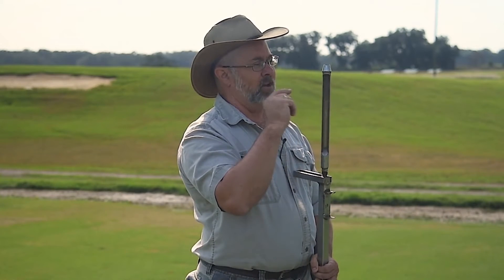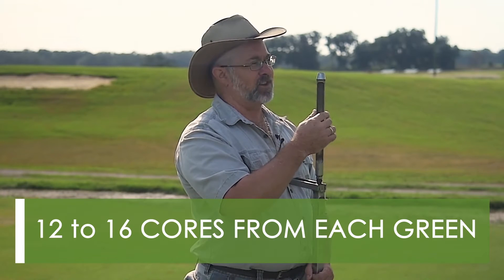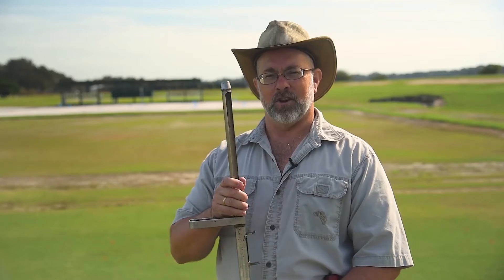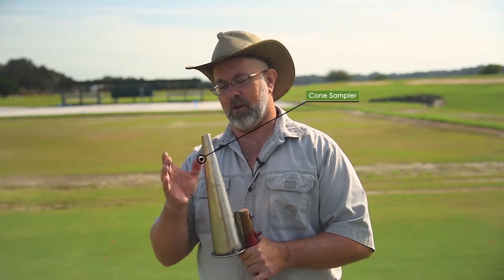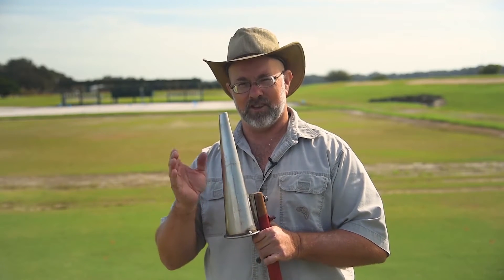Now for my sample, I'm going to be taking 12 to 16 cores from each green, and this type of device needs to be emptied between each core, which is a lot of emptying. So what I'm going to use instead is a cone sampler, which allows me to take all my cores from one green in one sample and I only have to empty it out once.